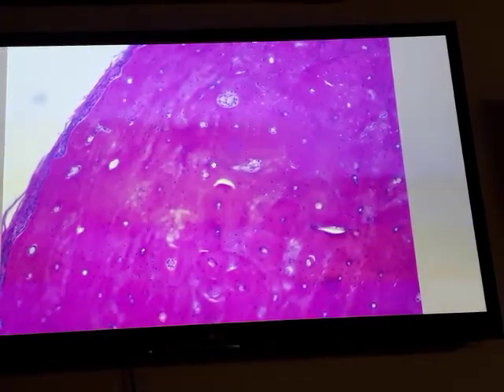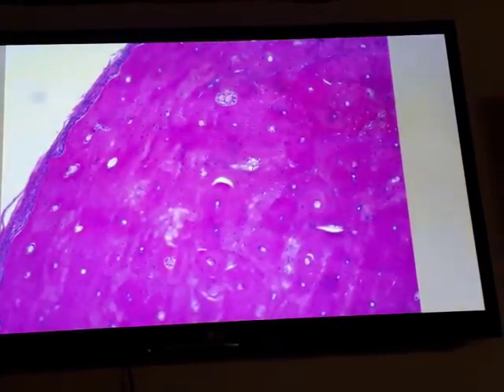This is a Volkmann's canal connecting between two Haversian canals, seen in this section of decalcified bone. On the next view, it appears in a longitudinal section. This is the Haversian canal, and this is the Volkmann's canal, connected between Haversian canals.